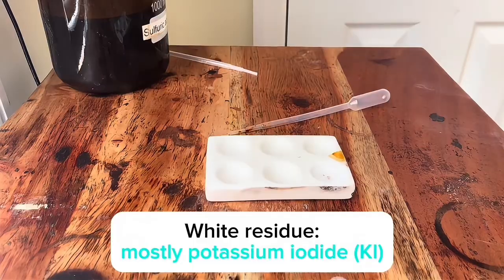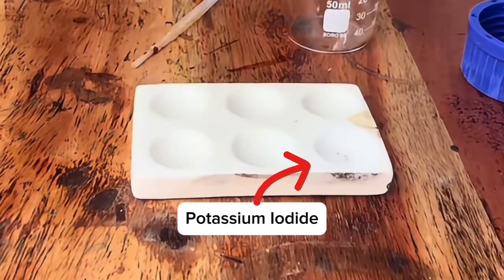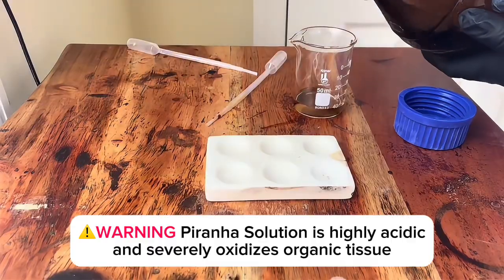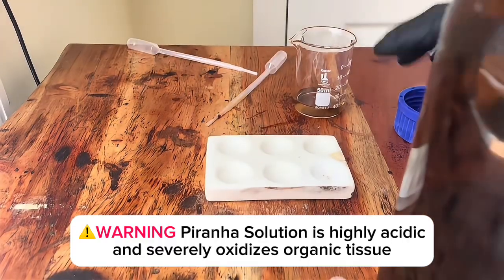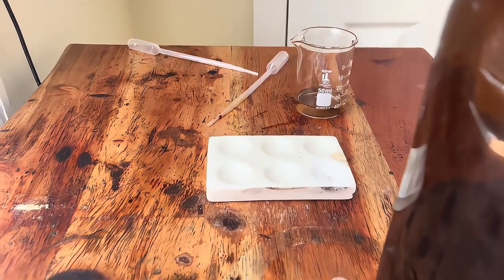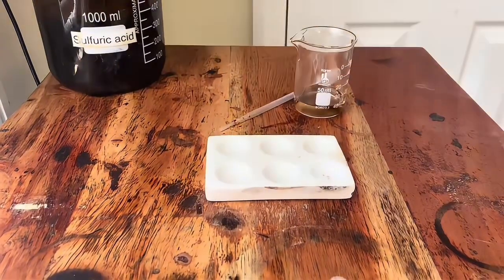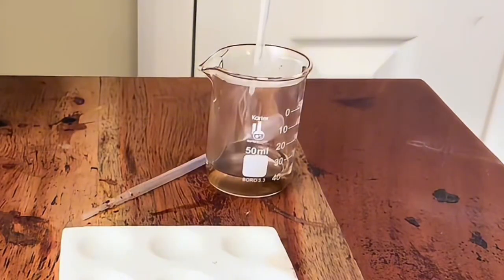Once fully evaporated, I'm left with some potassium iodide. Next, I'm gonna make piranha solution. First, I'll pour some concentrated sulfuric acid into this beaker, then I'll add some 12% hydrogen peroxide.